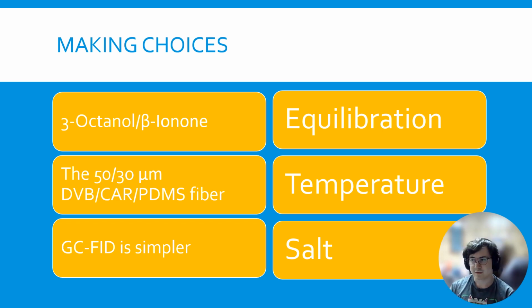There's a lot less steps in terms of using it. It's fairly straightforward. And also because right now, like I mentioned earlier, the septa doesn't need to be replaced after every use, so it makes it more reliable, and it consumes helium at a lower rate than the one that's coupled with the mass spec.